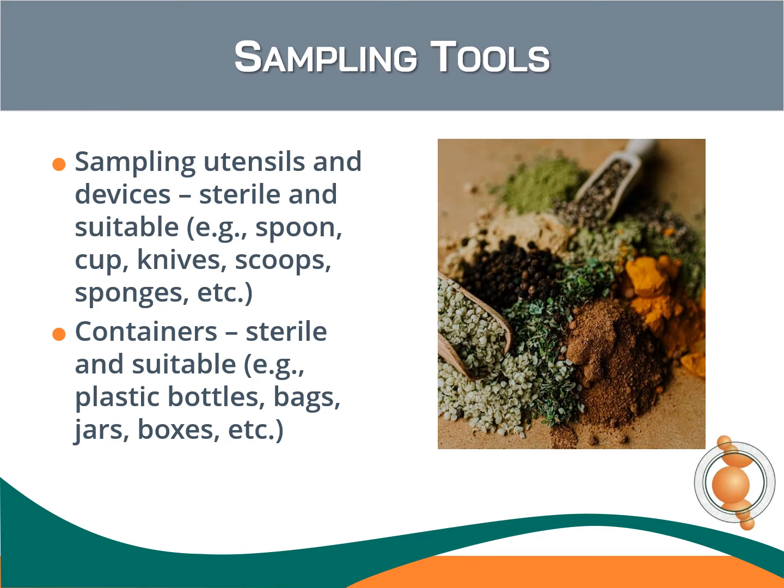No matter what shape or size the tools, the ones used for sampling for microbiological testing should be sterile, or at least cleaned with a disinfectant and then rinsed thoroughly. Because if the tools are not sterile, the sample can become contaminated and the results will not be accurate.